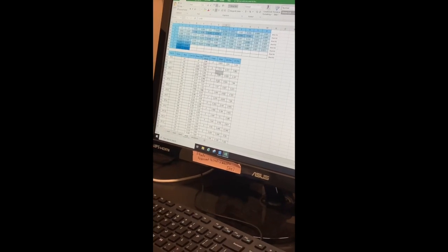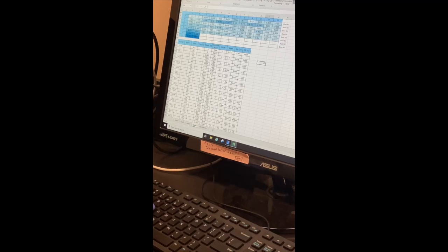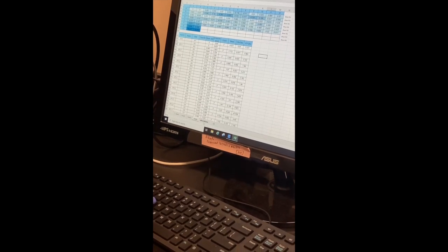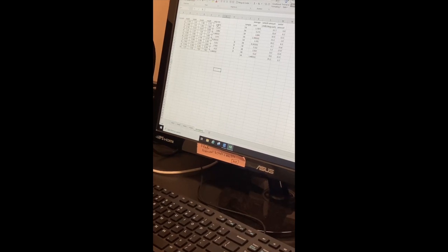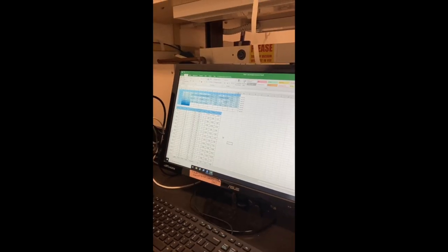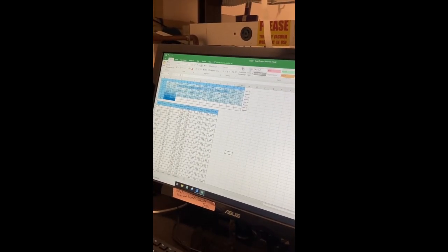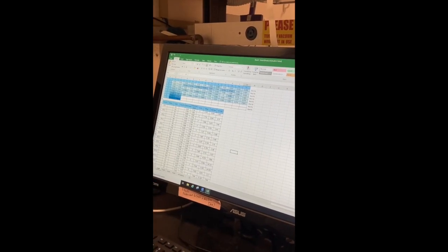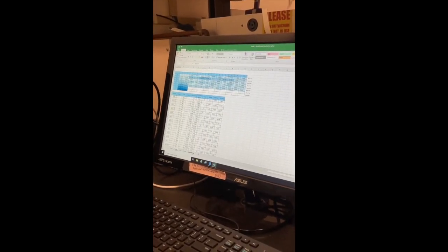And then you use the mean values of the concentrations of the certain samples that you want to look at to calculate the amount of concentration you have. And I guess I'll just click, there you go. So for every read, I'll have the blank 562 exported to an Excel, and then also the concentration as I previously showed. And then that will be in for all of the reads once they're ready.